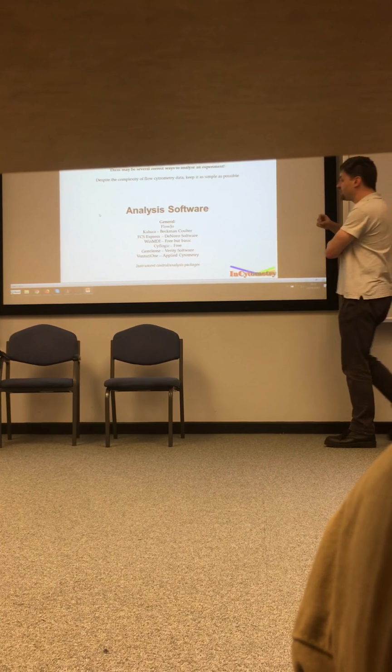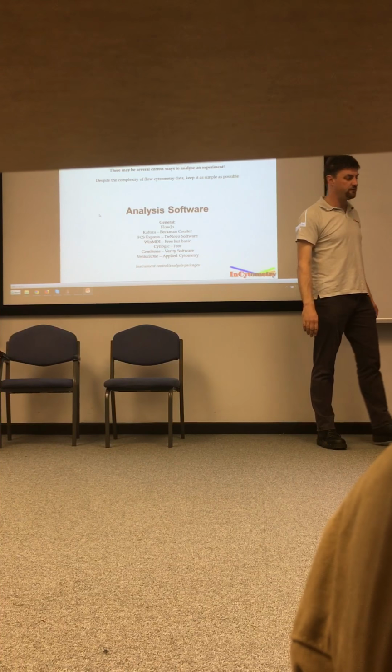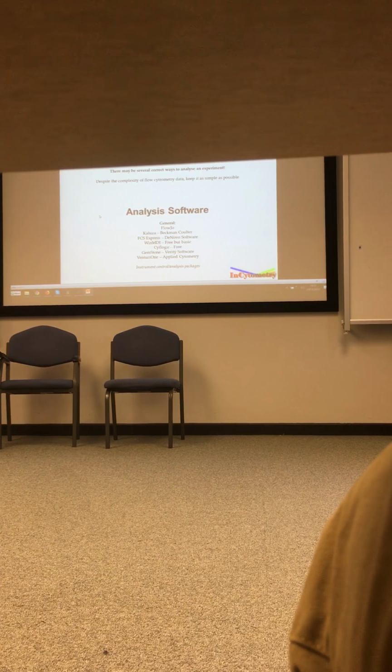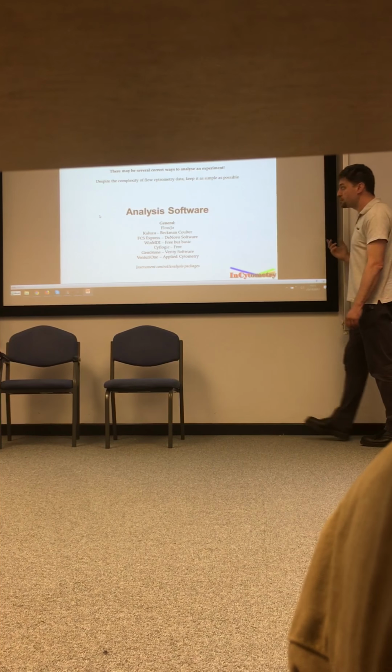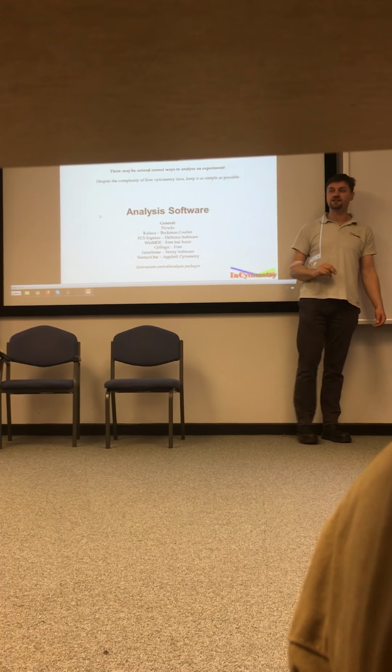So in terms of analysis software, there's a lot out there. This is by no means comprehensive, by no means. Flojo is the most common, one of the most common. It's by far the most powerful, but it's also got a very, very steep learning curve and is horrendously expensive.